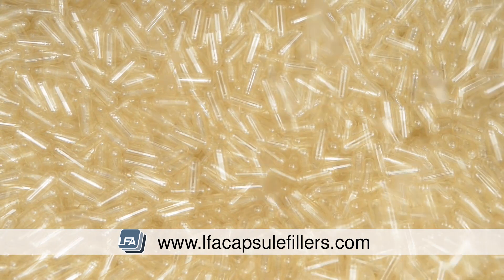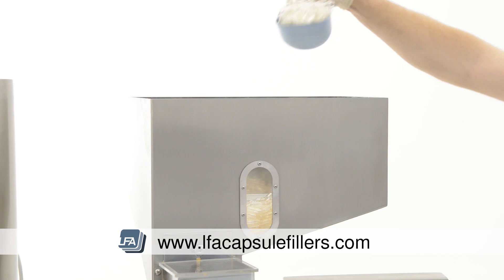The SACF series can be used with all sized capsules using either powder, granules or pellets.